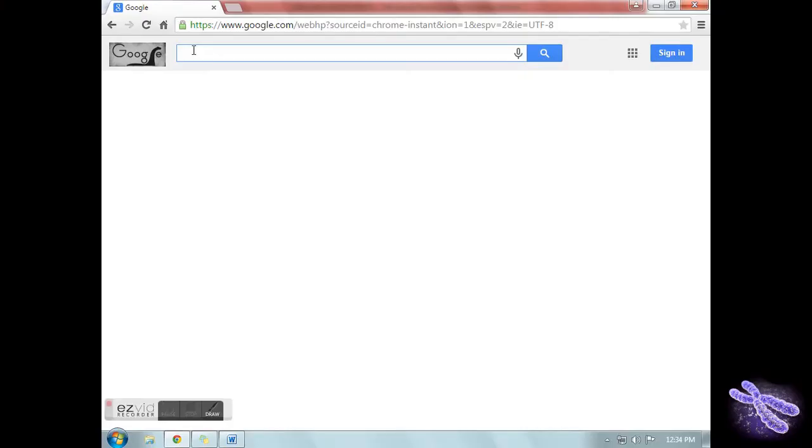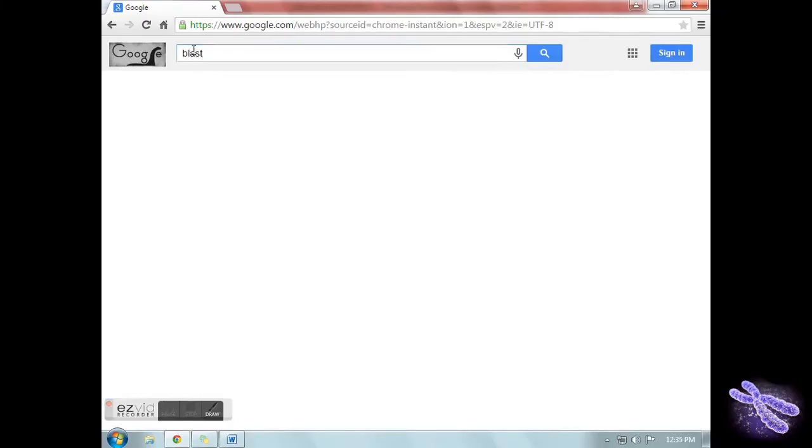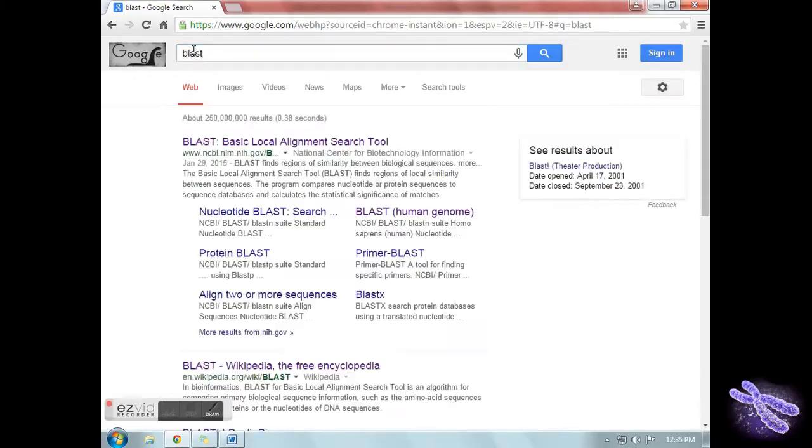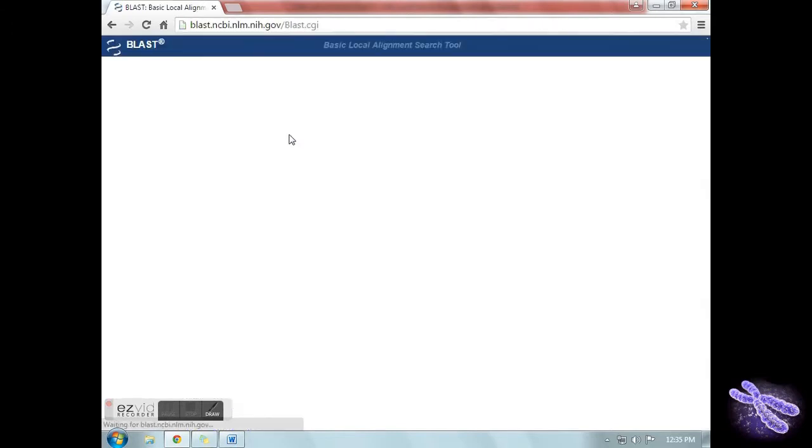Here is an easy tutorial video for college students on how to navigate the BLAST website. Visit Google and type in BLAST. Click on the first link.